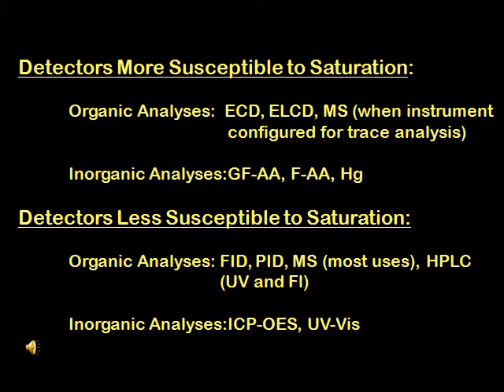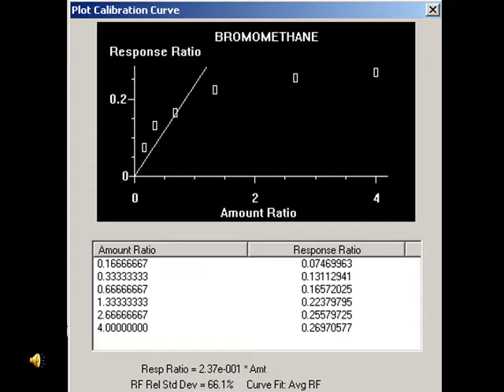In this slide, we have attempted to illustrate how susceptible the more commonly used environmental detectors are in regards to saturation. The easiest way to determine if saturation is being encountered is to review a plot of the calibration curve for the analysis.